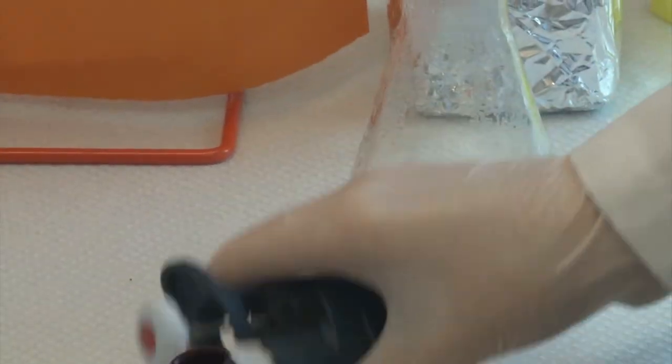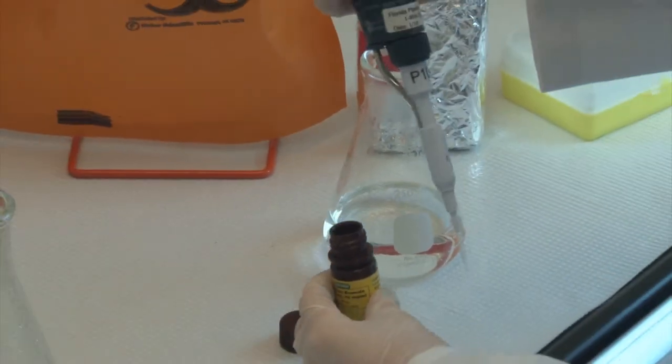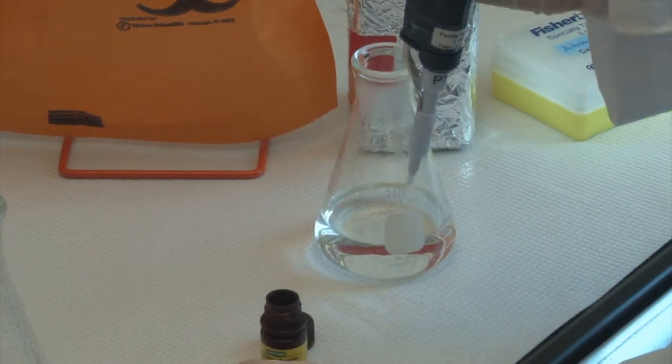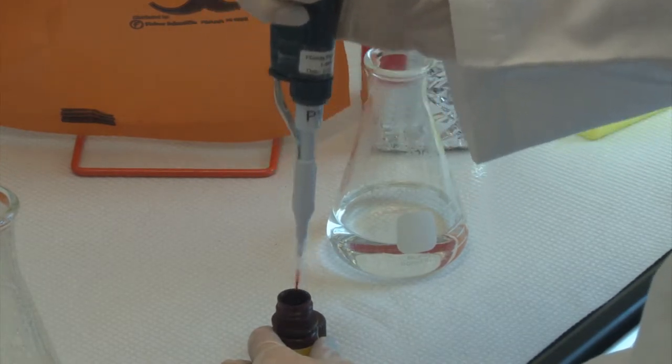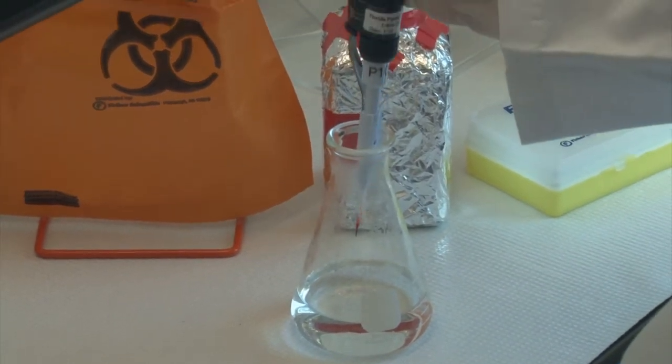Make a 1% agarose gel and let it sit in the gel chamber with 1x TAE buffer and 2 microliters of ethidium bromide.